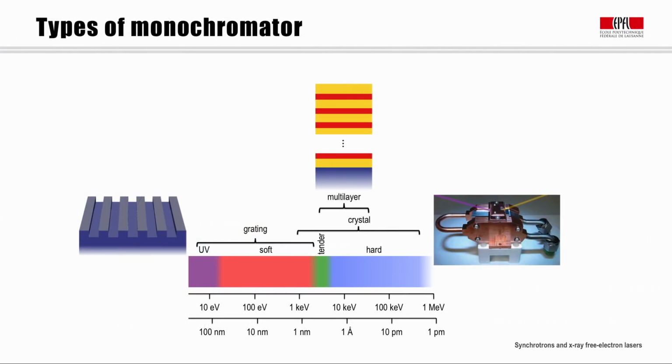Depending on the photon energy range of the beamline and the demands for flux, different monochromator types are used. Soft X-ray beamlines use gratings, while most hard X-ray beamlines employ monos based on crystal diffraction. The tender X-ray regime is also mostly served by crystal monochromators, though they can use so-called multilayer monochromators as well. Multilayer monos are also employed fairly extensively in the medium hard X-ray regime as a means to obtain more flux through their intrinsically larger bandwidths.